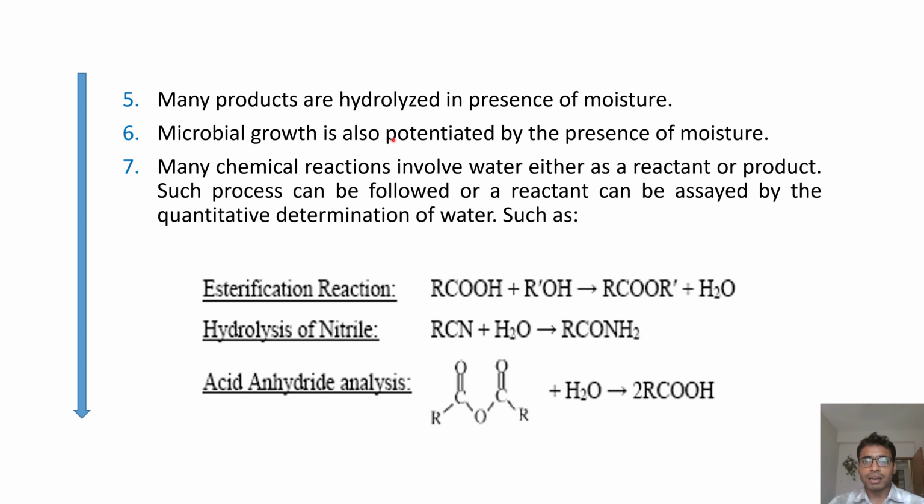Moreover, many products are hydrolyzed in presence of moisture. Microbial growth is also potentiated by the presence of moisture. Then many chemical reactions involve water either as reactant or product. Such processes can be followed, or a reactant can be assayed, by quantitative determination of water.